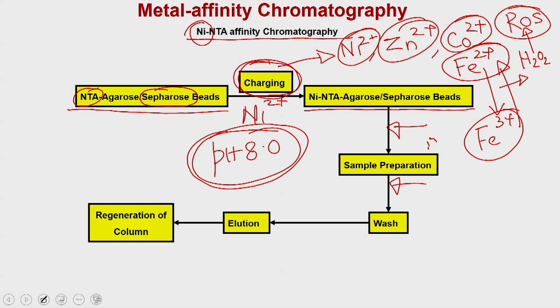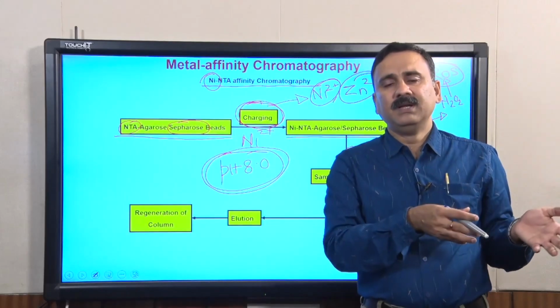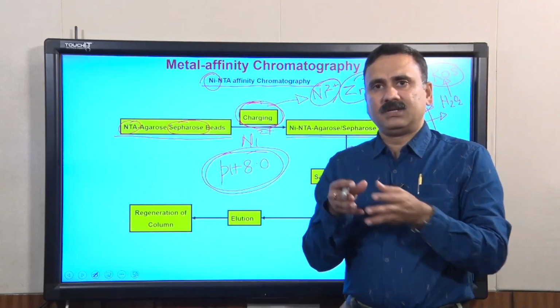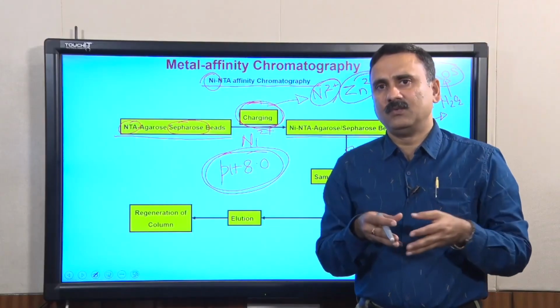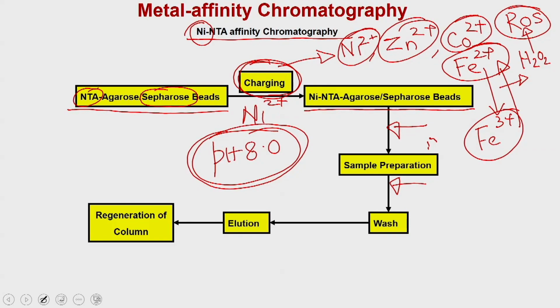Most of the time people do not prefer the phosphate buffer because it contains a large amount of salts, so you can use Tris, which is a purer salt, because the phosphate buffer also contains many types of salt and other things. So, people do not prefer PBS, or phosphate buffer, compared to Tris. You can use Tris pH 8.8 or pH 8, whichever Tris you want to use, and then you prepare the sample in, suppose, 100 millimolar Tris pH 8, and then you apply the sample.